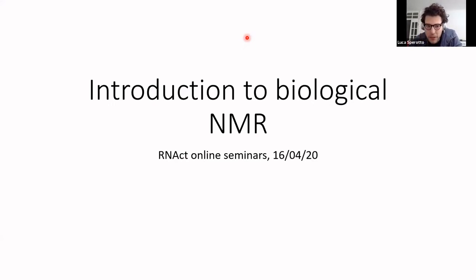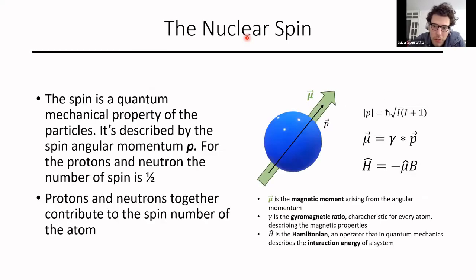So the idea was just to give an overview of the most common NMR methods, the most commonly used methods in NMR spectroscopy for doing different things. But before doing this, I just want to give a quick overview on the background of what we are measuring basically.